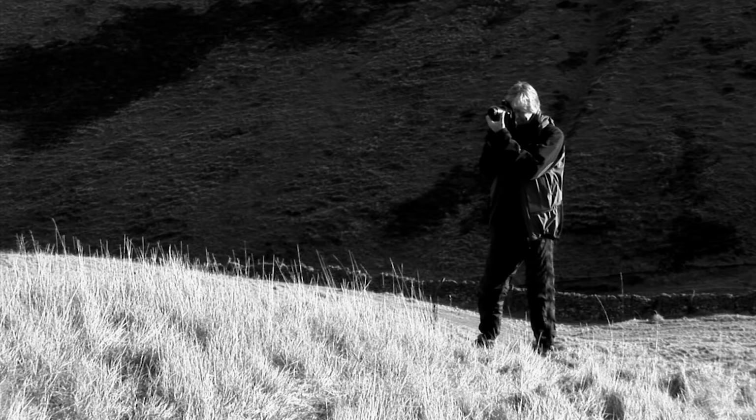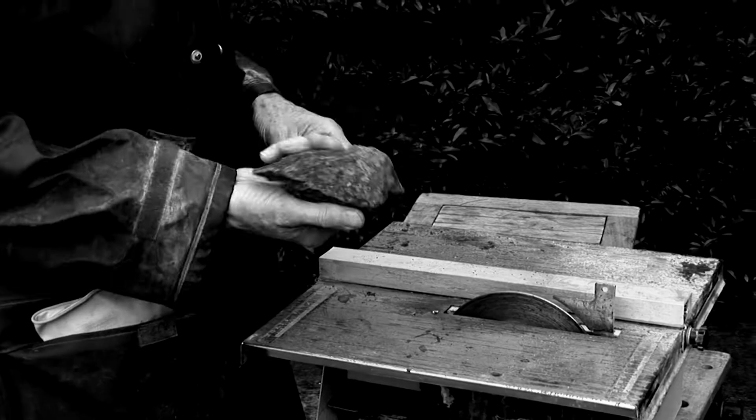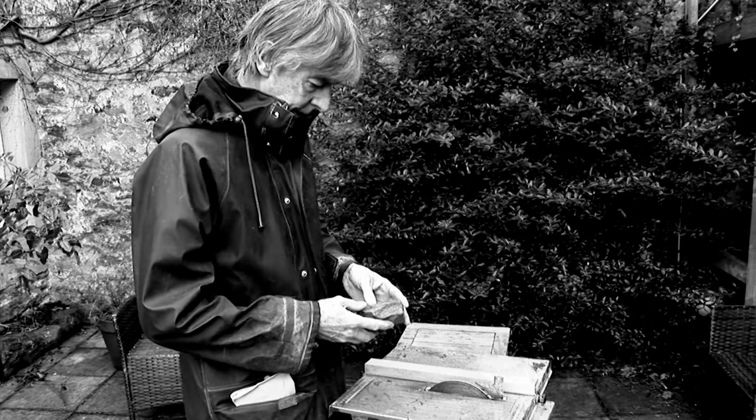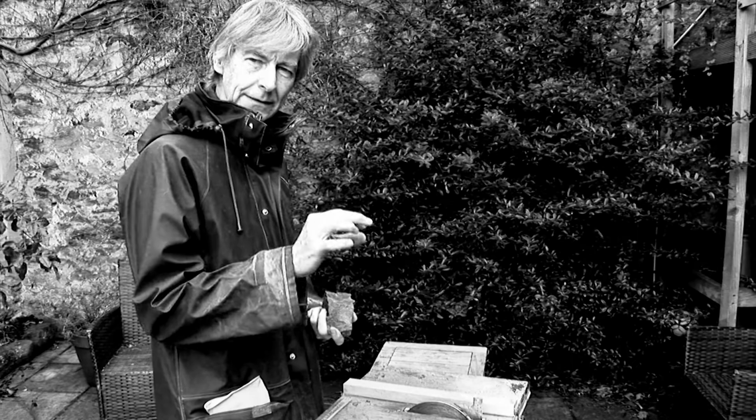I'll go and get a camera. Right. I just want a picture of that. This is the rock that we found at that little crag. So it's that ash from the original volcanic explosion. So I'm going to feed it through here and eventually cut it down into a small block that'll then stick onto a glass slide.